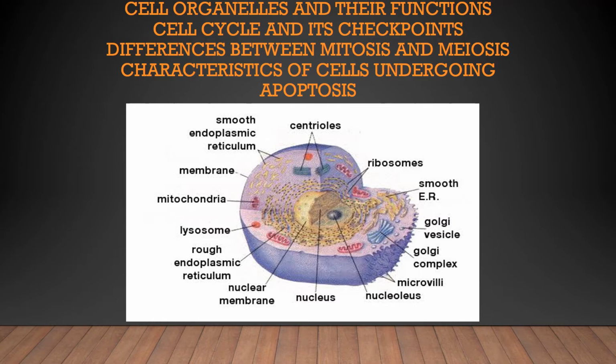So moving on. Okay, almost forgot to tell you, but histological sections of the cell under light microscopy are not that common. So if you want to study this further, you'll be better off studying them under an electron micrograph. So that's it. Let's move on to the next section.